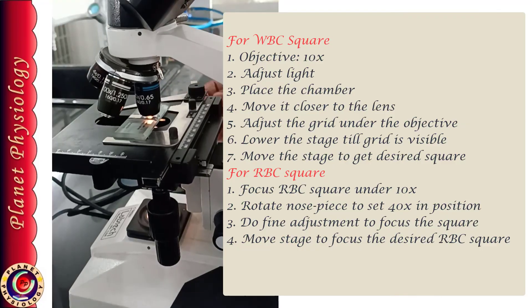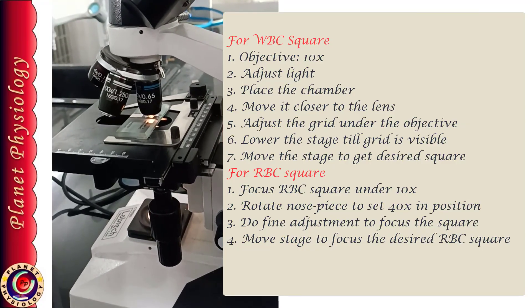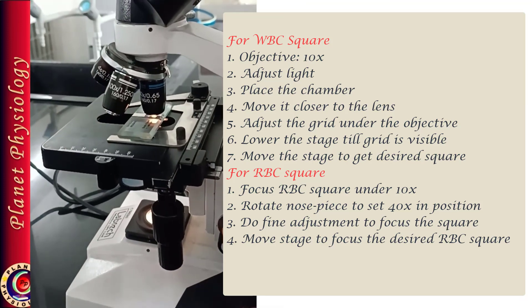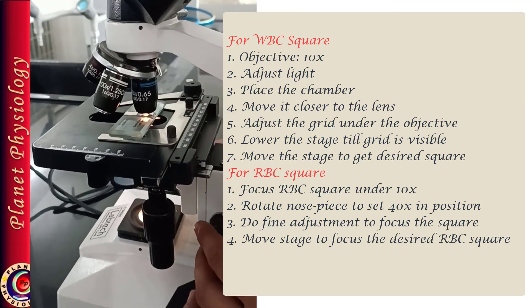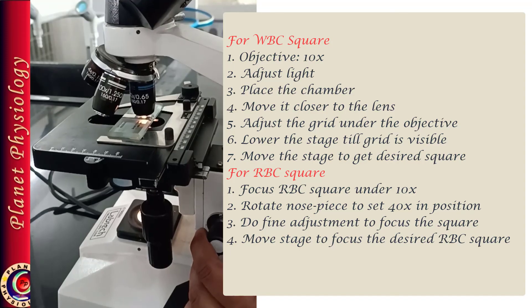Do not change any other setting, please remember. Do the fine adjustment to make the grid clear and then find any one RBC corner square to start the experiment.